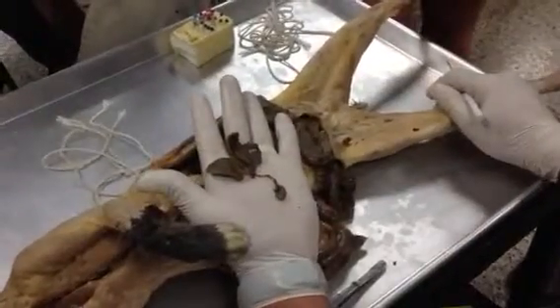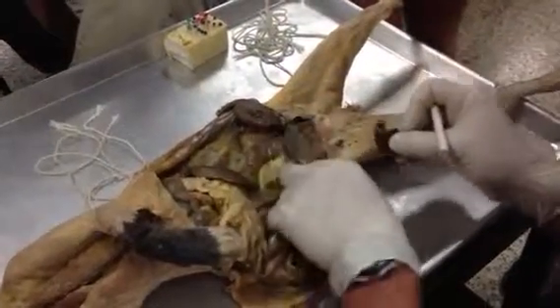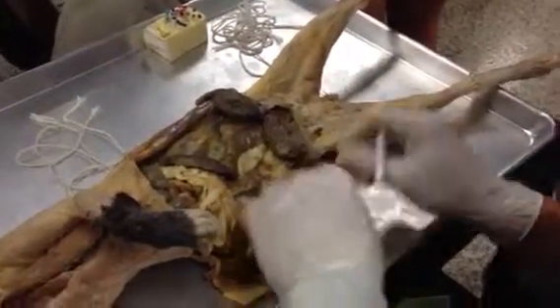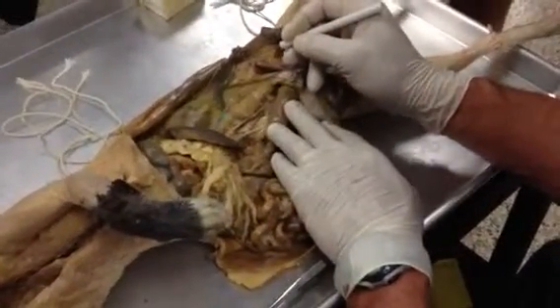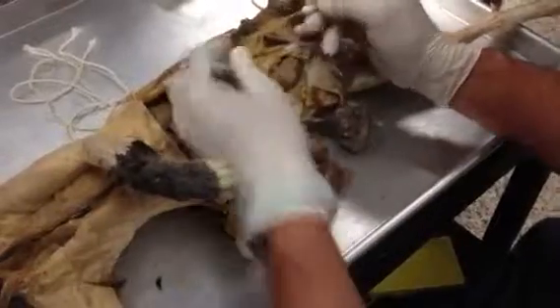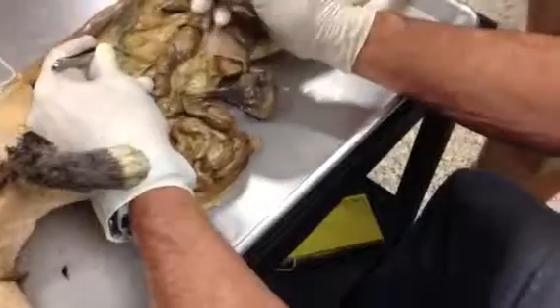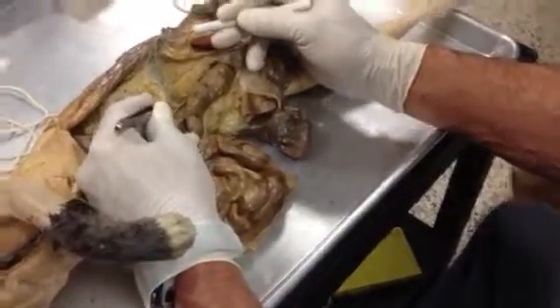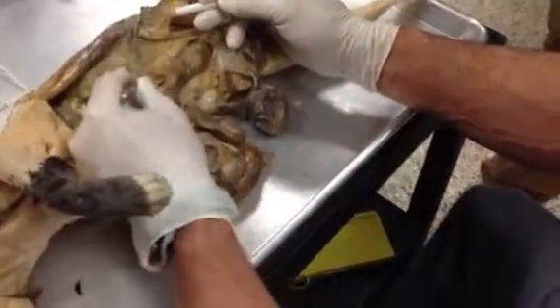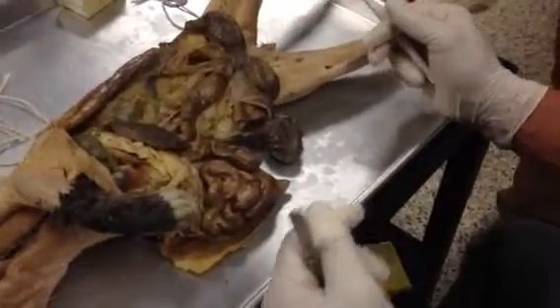Alright? Questions there, folks? Oh yeah, that's the other thing too, the ovarian vein. There now is the ovarian vein. Right there. Now, because this cat is pregnant, that ovarian vein probably gets 10 times thick. Alright? If this cat is not pregnant, the ovarian vein is going to be about that thick. Thin, thin, thin. Yeah, the cat is pregnant, thick, thick, thick ovarian vein. And then when she's done being pregnant, it shrinks down again. Remember, she's also carrying a lot more blood. Her blood volume goes up during pregnancy.